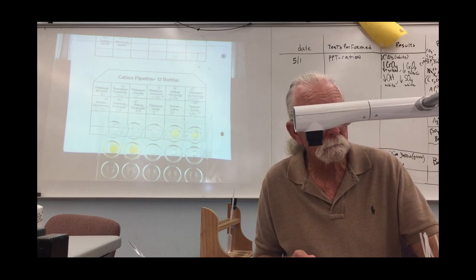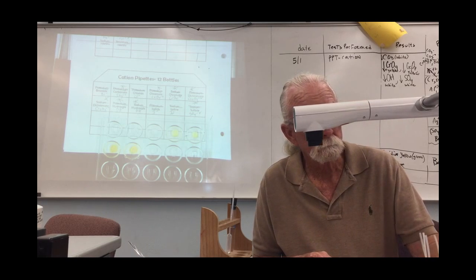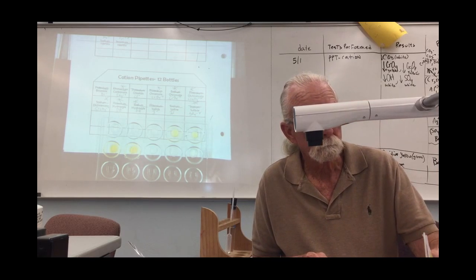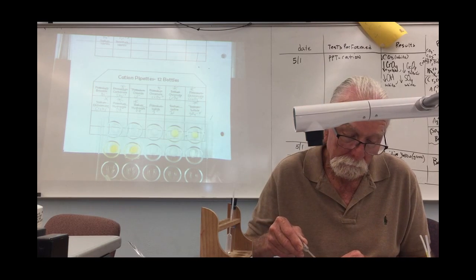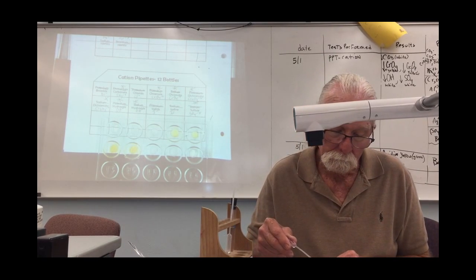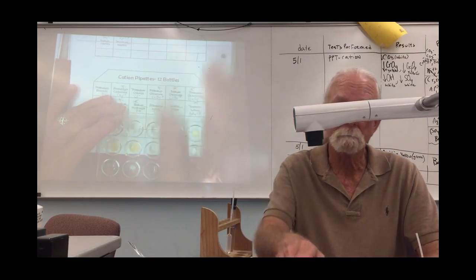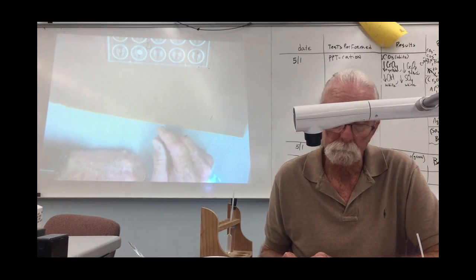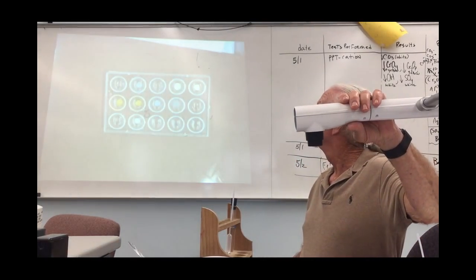That was hydroxide. This was hydroxide. This is iodide. This is iodide. And this is sulfate. Now I give them time to react. And I look. Oh, sorry. There they are.